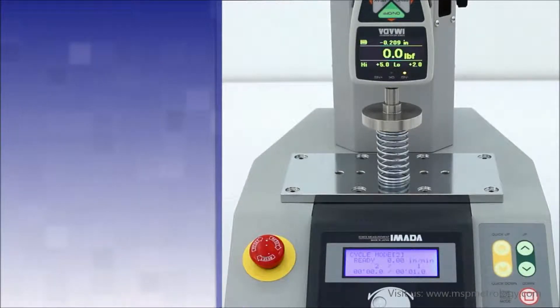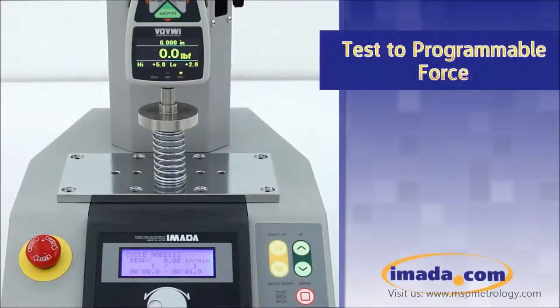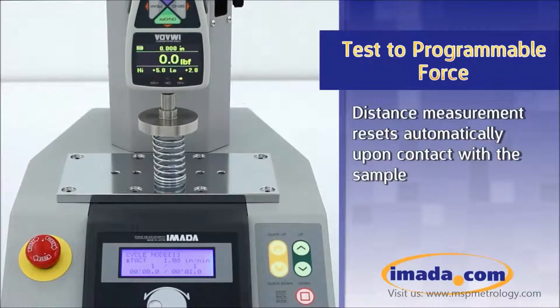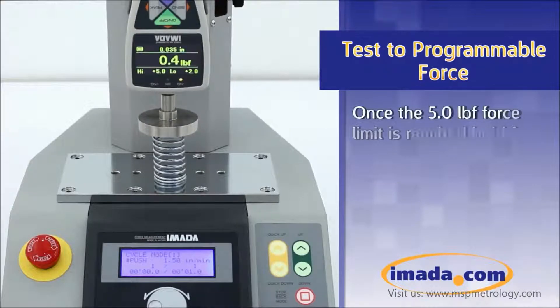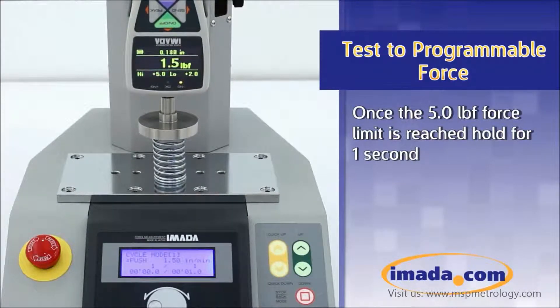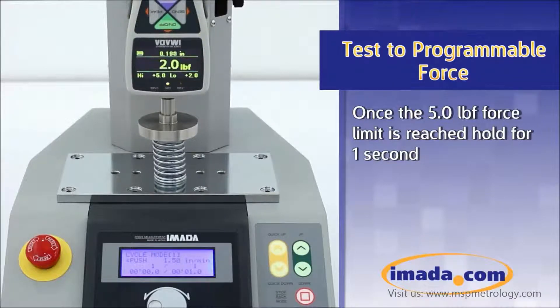The EMX275 is also able to test to a programmable force value. The test stand will compress the spring down to 5 pounds force. Once the 5 pound force limit is reached, the stand will hold for one second.